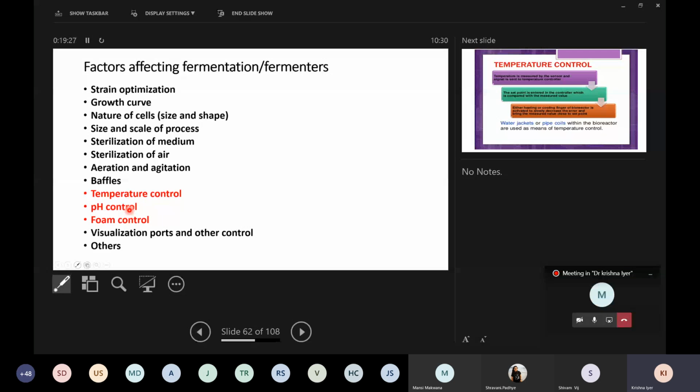In this regard, you will find that there are two types of fermentations. One, where you need to maintain a temperature, but if the temperature goes plus or minus maybe 4 or 5 degrees, it doesn't do too much. But anything more than that, it starts to affect the fermentation. And there are other fermentations where you have to maintain even the temperature to within a degree to get efficient production. So how much you need to control the temperature would depend on the organism you are working with and the process you are doing. Sometimes very stringent controls are needed, and sometimes a little lax control, with a little more window, is permitted.